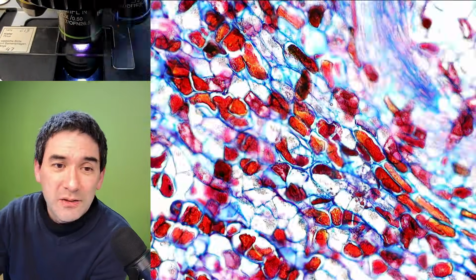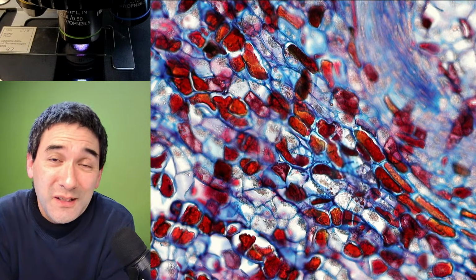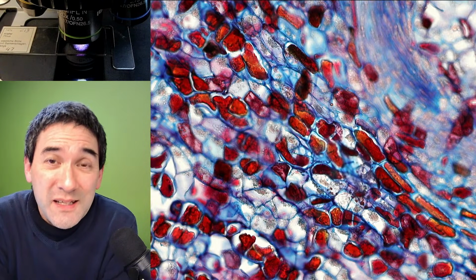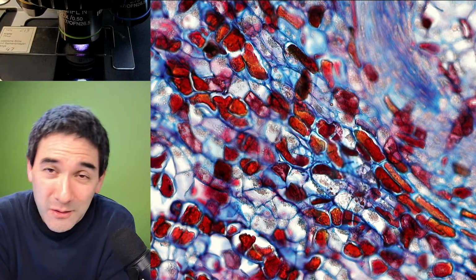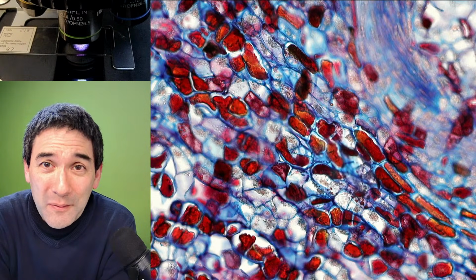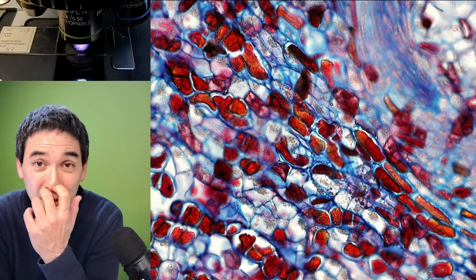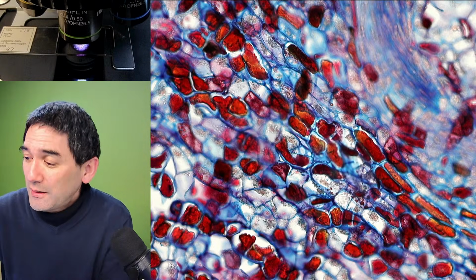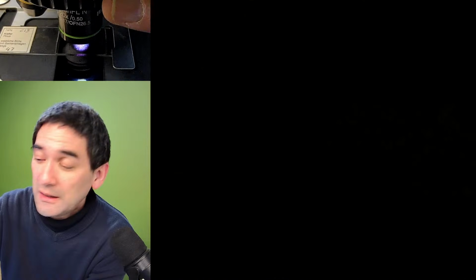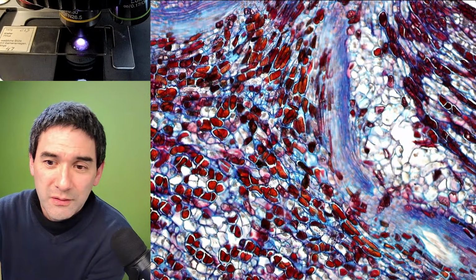I have to say the following. These days, luckily, it's easier than ever before to do microscopy as a hobby because the devices, the microscopes, are easily accessible and also affordable. I mean, this used not to be the case. I remember when I was still, I don't know, 30 years ago, just finished university, I wanted to get myself a microscope, but they were expensive. And they were not quite as readily available. Yeah. So for this reason, these days it's significantly easier to simply start it.